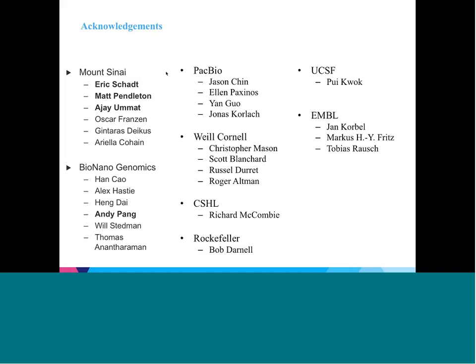So it's early days. We have done some work already with cancer cell lines and gotten very promising results. And in some cases, we've been able to show that we corroborate next-gen sequencing results, and sometimes we show errors made and can uncover errors made in the next-gen sequencing. So it's highly complementary to those technologies. We are now moving into other types of samples.